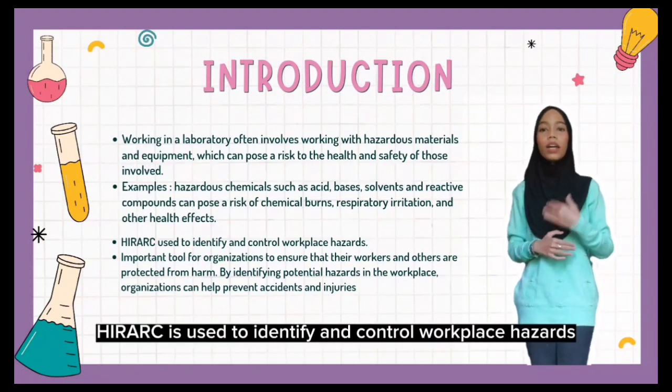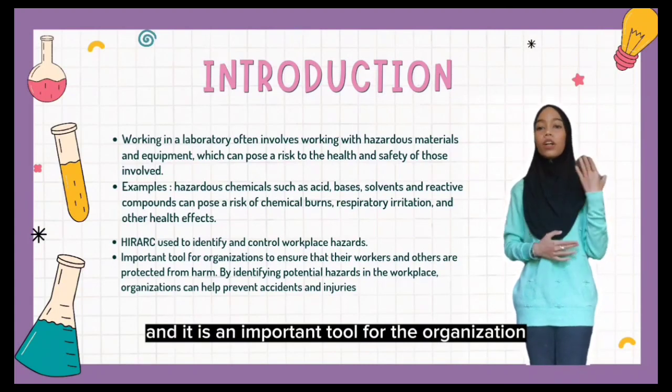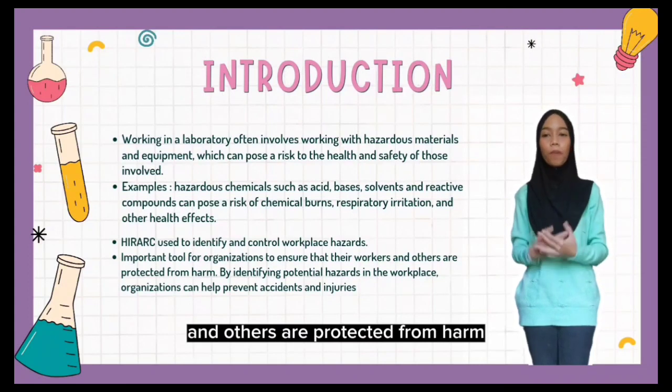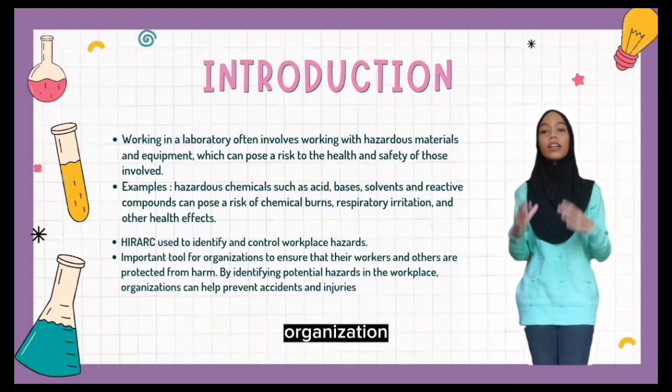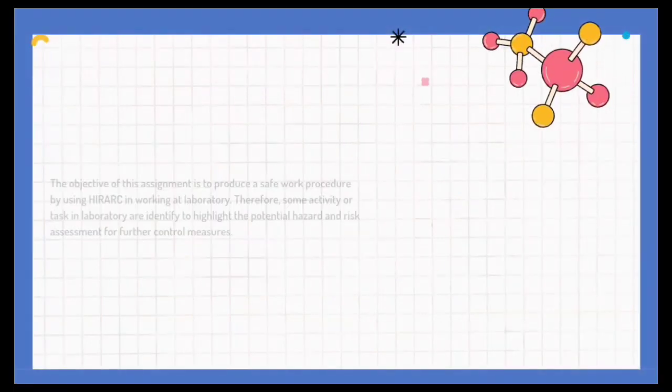HIRARC is used to identify and control workplace hazards, and it is an important tool for the organization to ensure that their workers and others are protected from harm. By identifying potential hazards in the workplace, organizations can help prevent accidents and injuries from happening.